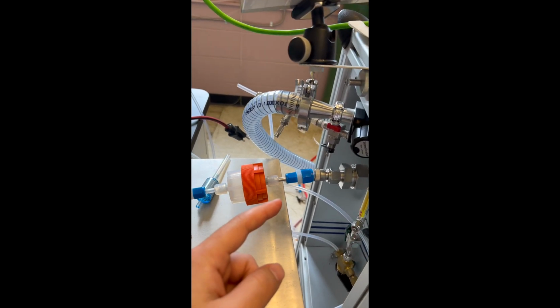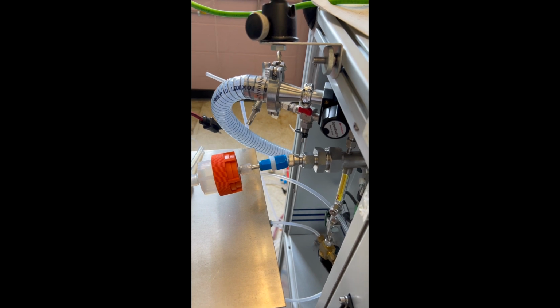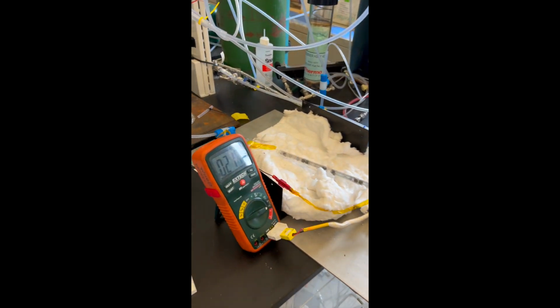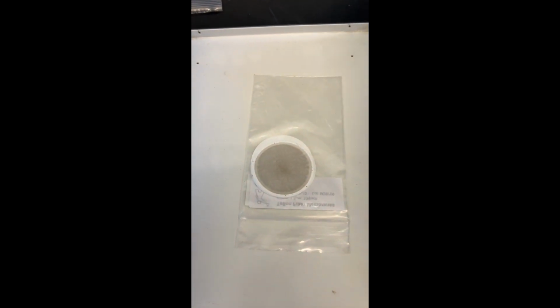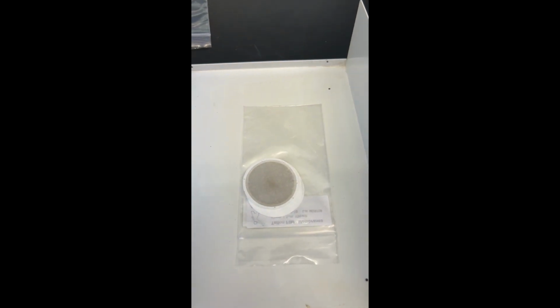That volatilized PFAS is entering what's called the IMR, or ion molecule reactor. This ion molecule reactor introduces the iodide anion to all incoming species. Finally, here we are measuring the temperature of the thermal desorption tube using a thermometer. Here is an example of a sample filter. So, thank you very much.